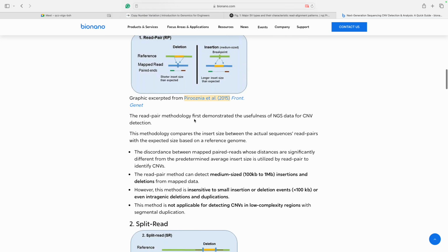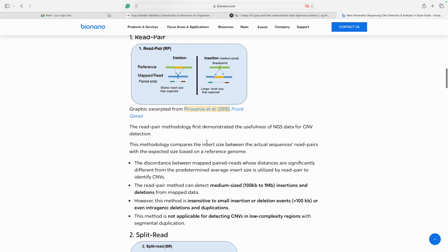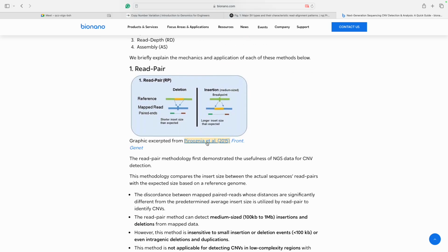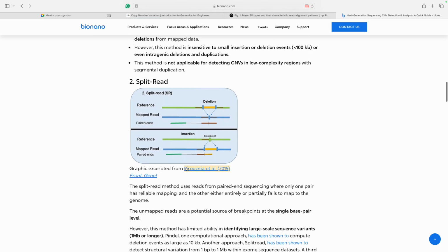What it does is it gives the distance, the difference in the reads. So, basically, here we can find a complex structural variant, but in case of split read, let's suppose a deletion has happened, or a duplication has happened, or an insertion has happened.